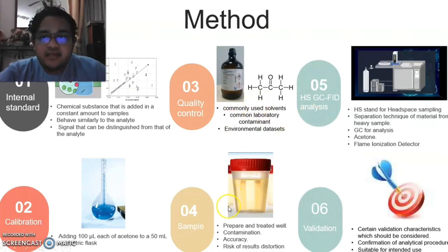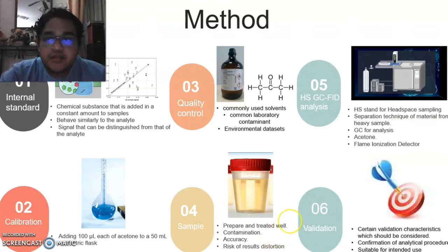And the next step is the sample. When we prepare all of the types of analyte, acetone, we need to prepare the sample. As usual, all types of sample need to be prepared and treated well to prevent contamination, improve accuracy, and minimize the risk of result distortions.